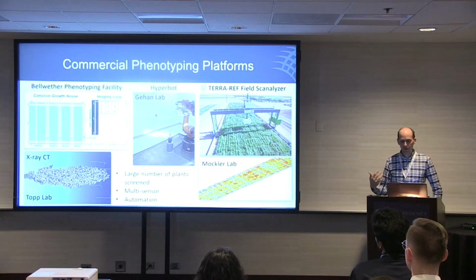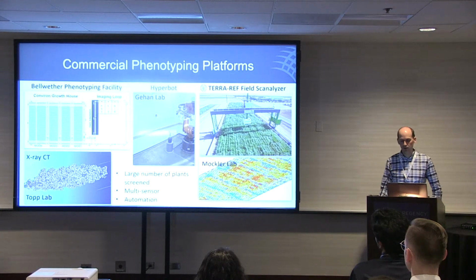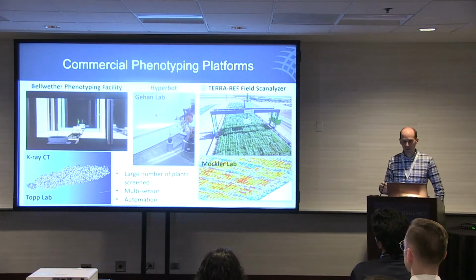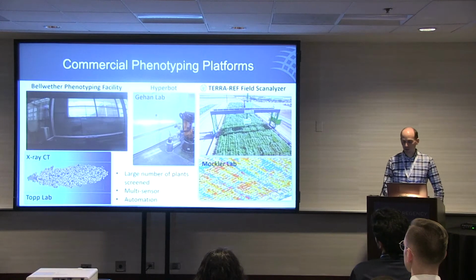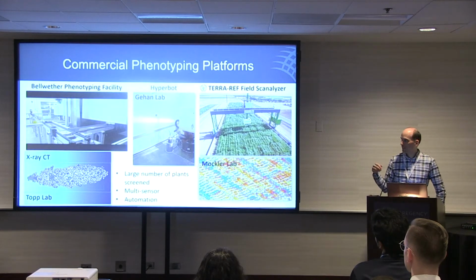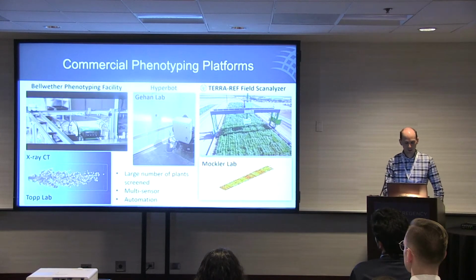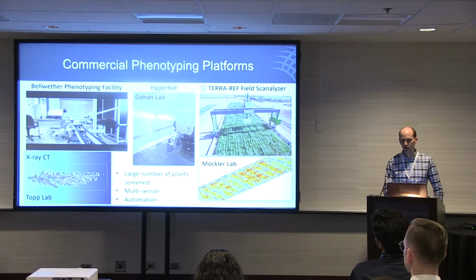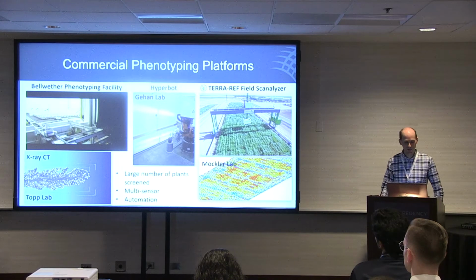I'll just say, one of my other interests in Clowder through this collaboration with David and others has been that it's actually a really useful platform beyond just the TERRA-REF program, because we have a lot of other phenotyping platforms at the Danforth Center. Just really briefly, the Bellwether facility is a growth chamber-based system where the plants move around on a conveyor belt through imaging cabinets.